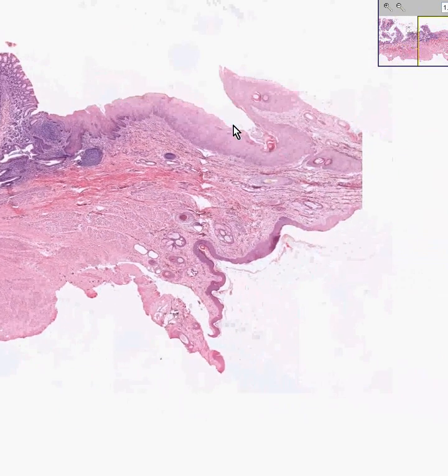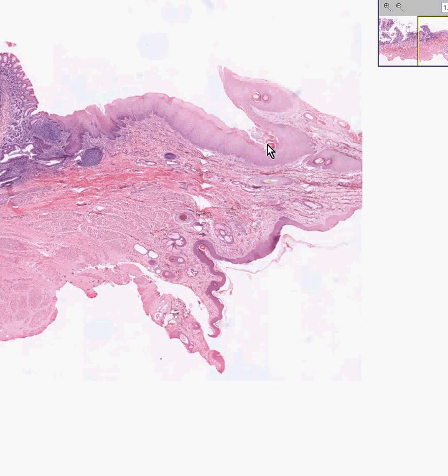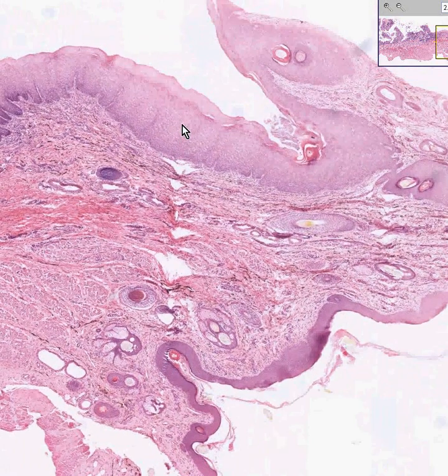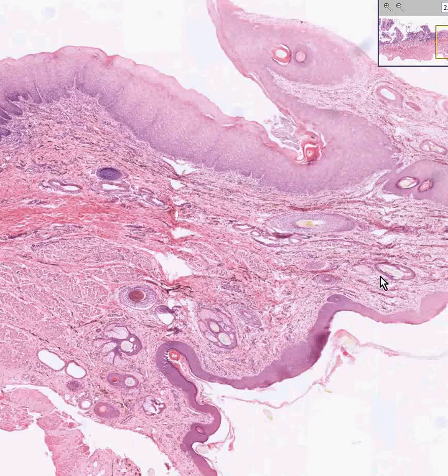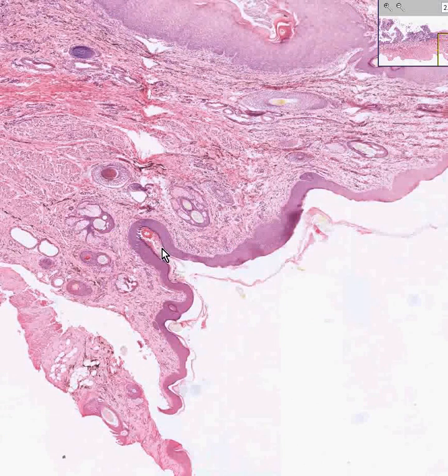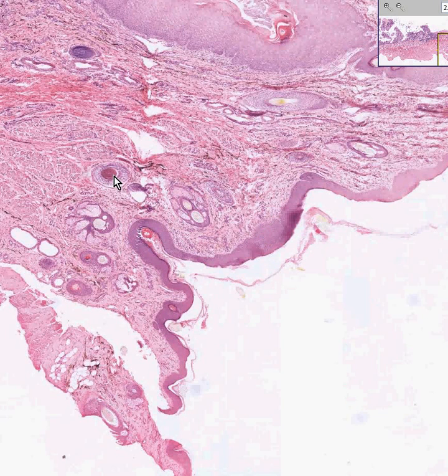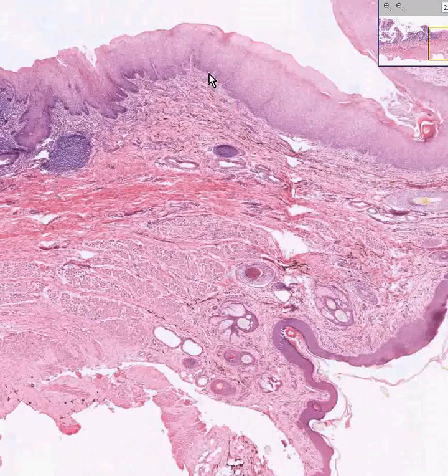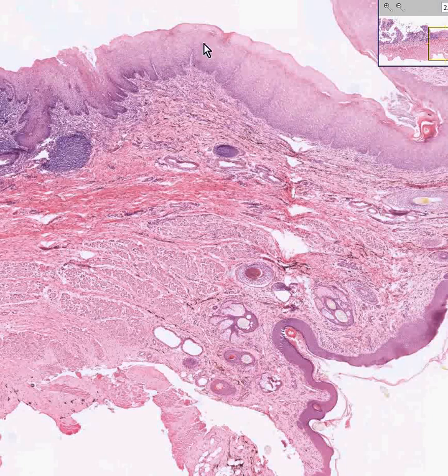Not very long after the squamous-columnar junction, you get more than just stratified squamous mucosa — you get keratinized stratified squamous mucosa with skin appendages, which is the definition of skin. This is classical skin: stratified squamous with a good stratum corneum, hair follicles, sebaceous glands, and perhaps a few sweat glands. This is in contrast to the stratified squamous non-keratinized mucosa of the anus, which does not have skin appendages.